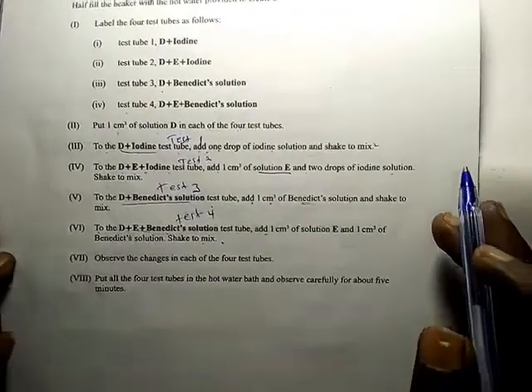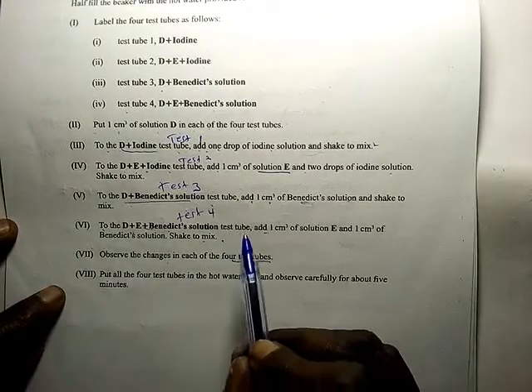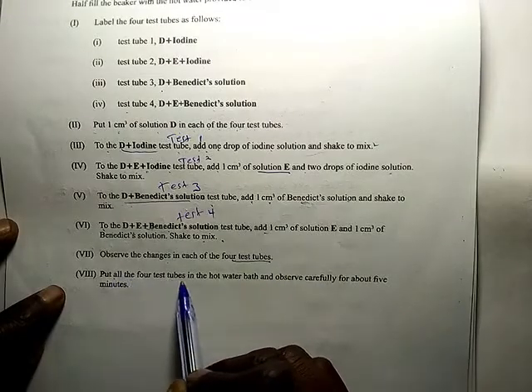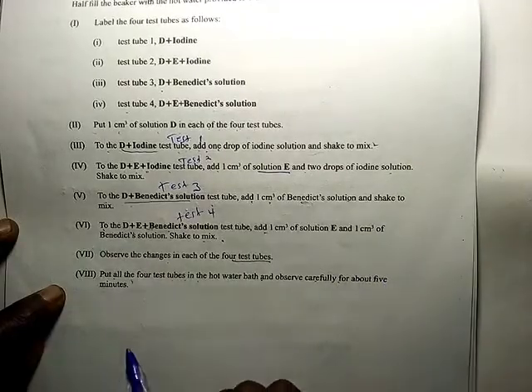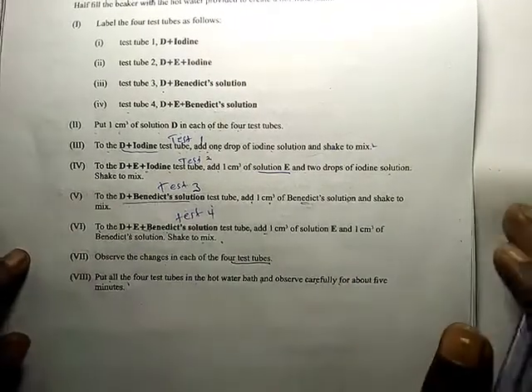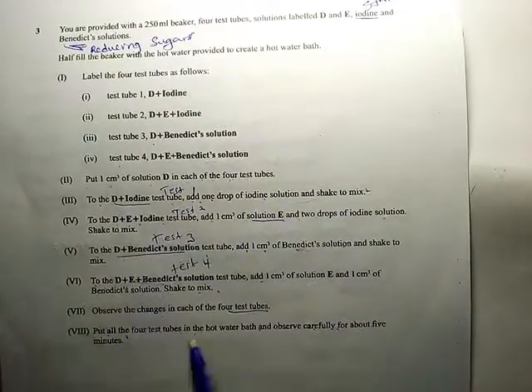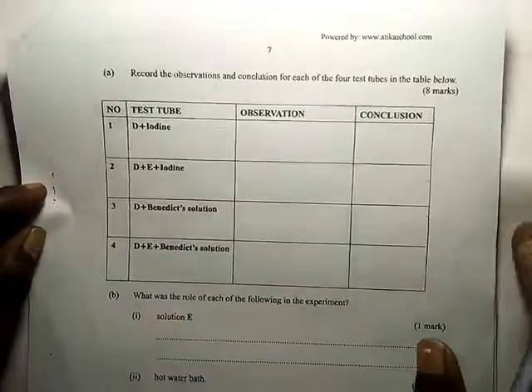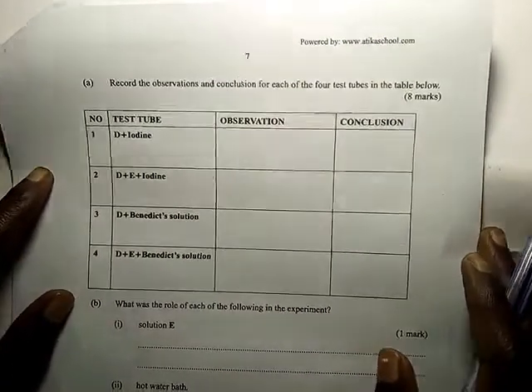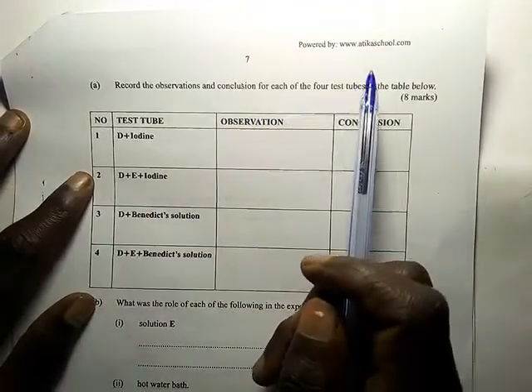Now, after you have done that all, observe the changes in each of the 4 test tubes. After you have observed each, put all the 4 test tubes in a hot water bath and observe carefully for about 5 minutes. In practicals, even in chemistry, just follow the procedure and you will understand. Let's go to the questions. Now here we are lucky because we are not told to write the procedure. We are only told to write the observation and conclusion.